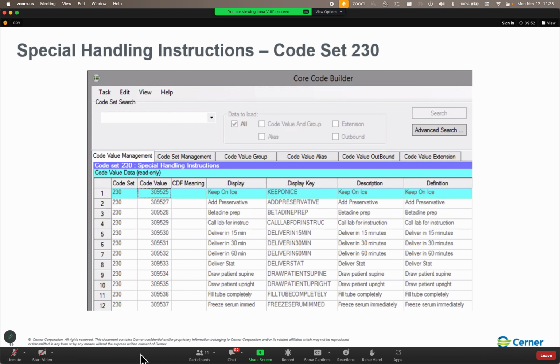Jerry, okay, yours I messed up on. Let's see, who are you? Your DL6, and DL6, the glucose fasting is routing to the analyzers. Okay, that's actually a little odd. Glucose fasting. Oh, yep, you're right. They must have updated that on me. Thank you very much, Jerry, for letting me know. I will have to redesign this.